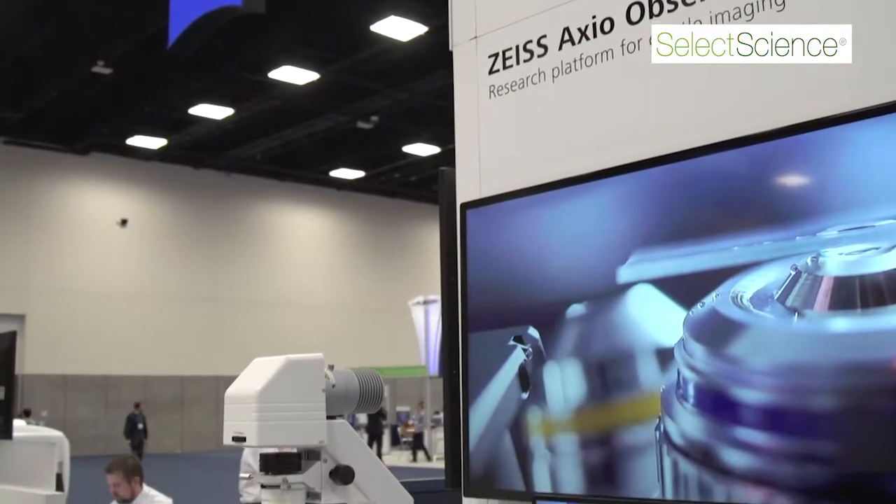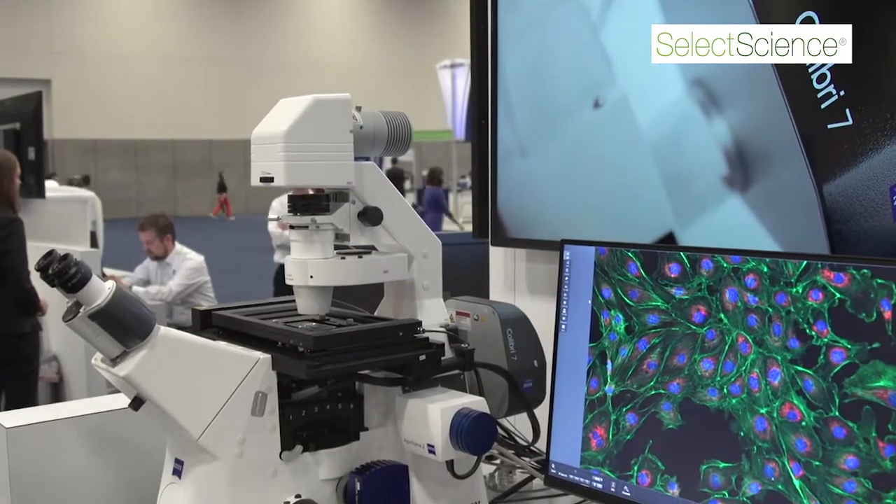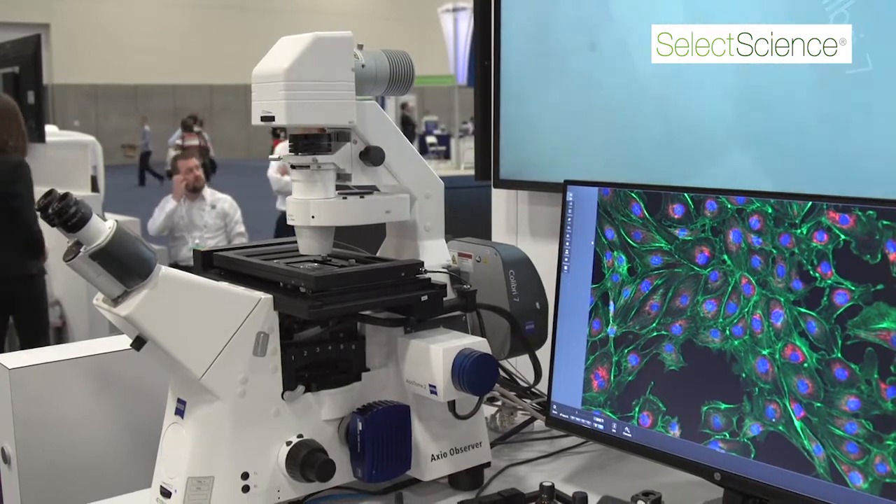My name is Chris Suwan. I'm a product marketing manager with Carl Zeiss North America, and today I'm going to speak with you about the Axio Observer 7 inverted microscope from Carl Zeiss. The Axio Observer 7 is an inverted motorized microscope that forms the basis of many of Carl Zeiss's high-end research microscopes.